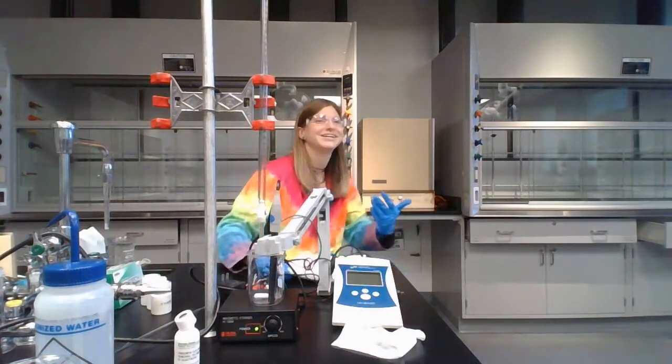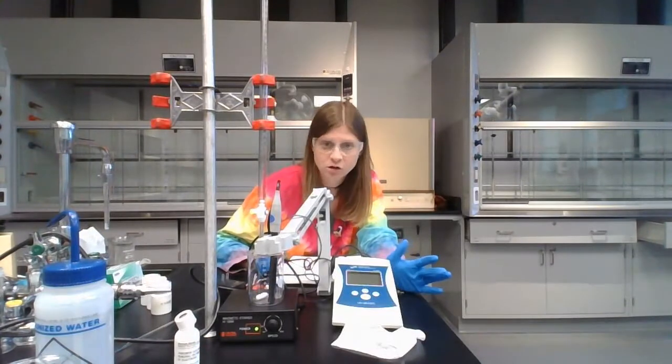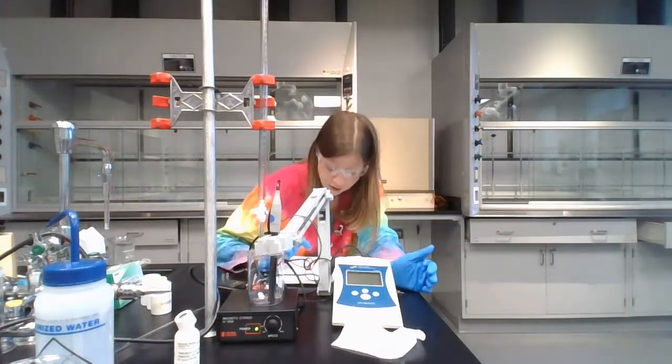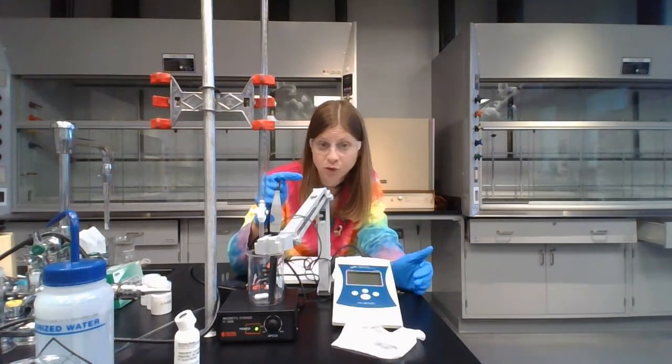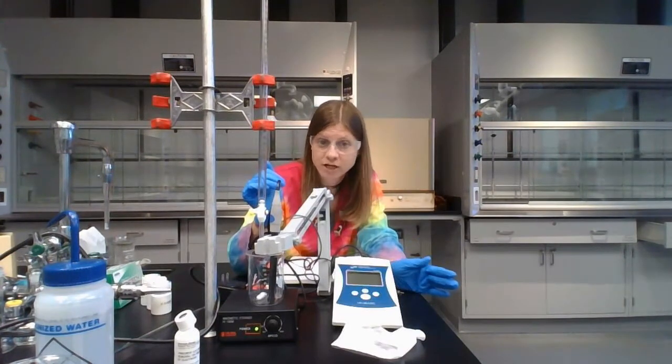These pH meters are really great, but there is a little bit of error in them. So to count as right next to each other, we're going to say they're plus or minus 0.03 away from each other. If the pH value only changed by 0.03 or less from one measurement to the one right after it, you have reached the end of your titration.